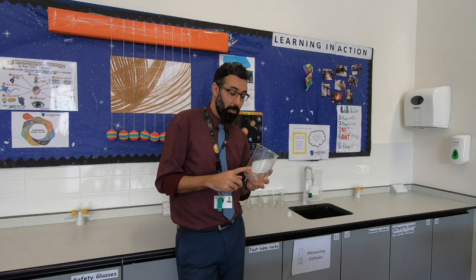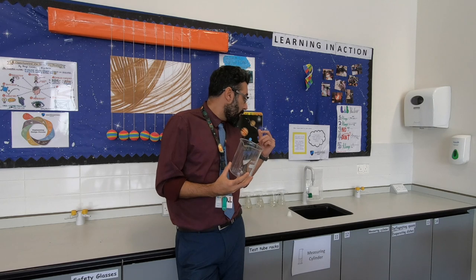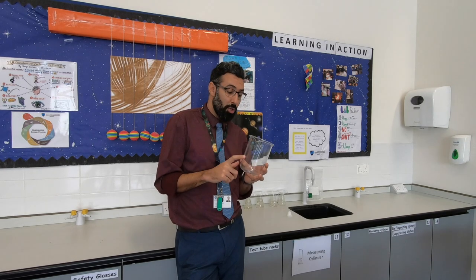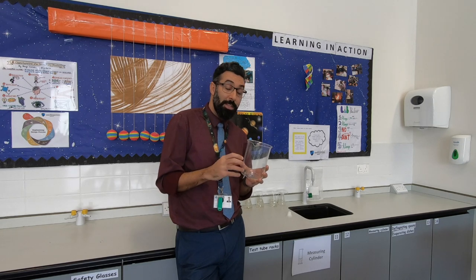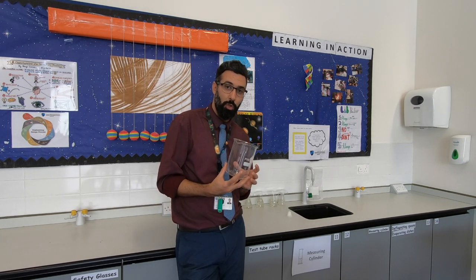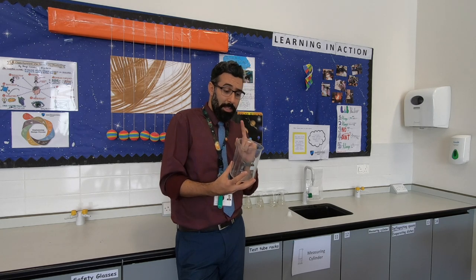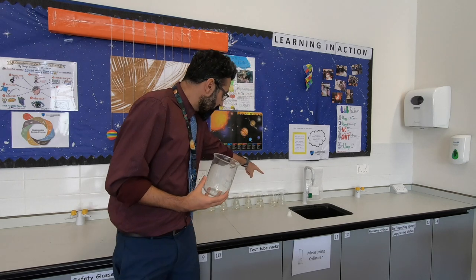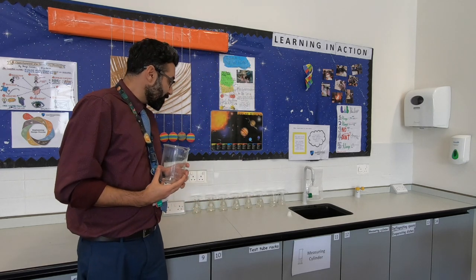We boiled the water at high temperature and added sodium acetate to make a solution until no more sodium acetate would dissolve — so we made a supersaturated solution. Then I kept it aside to cool down to room temperature and poured it into different flasks. You might say you can't find sodium acetate, but you can make it at home yourself with bicarbonate of soda and vinegar.